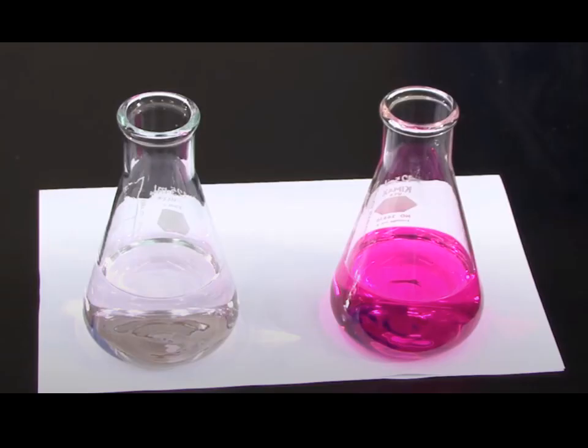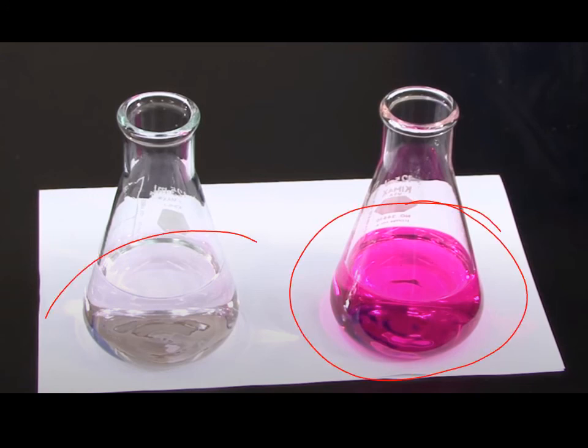So this shows 2 flasks. This one on the right here is absolutely overshot. This one here, you can just barely see a little bit of pink color in there. That's a nice, good end point. That's the way your end point should look, nice and light.